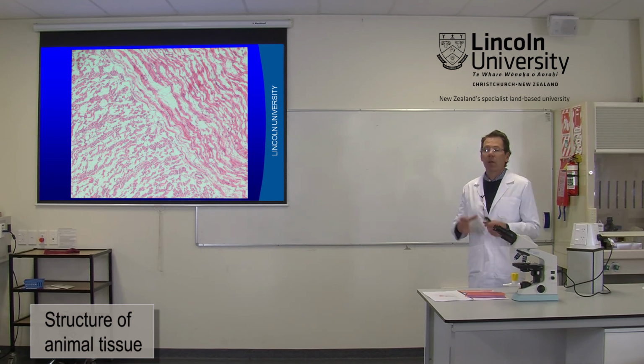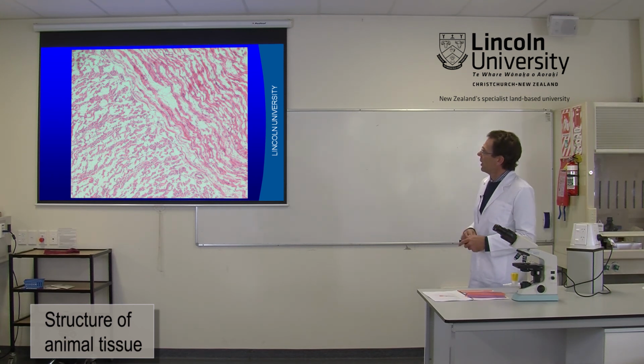So here we've zoomed in on the grainy structure and the ribbon-like structure inside the tongue, and what you're basically looking at here is these ribbons of pink are muscle fibres, and you are looking at those muscle fibres from the side. They're a bit crinkled because they've contracted because the animal's dead, but they are the ribbon-like structures that are those multinucleated cylinders. All the white that you can see is just air. If you can't see any colour, it means there's nothing there.